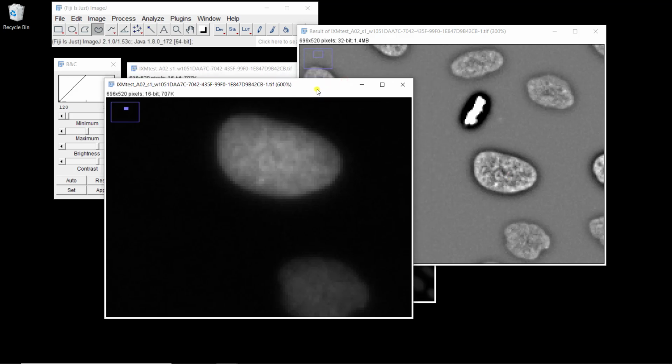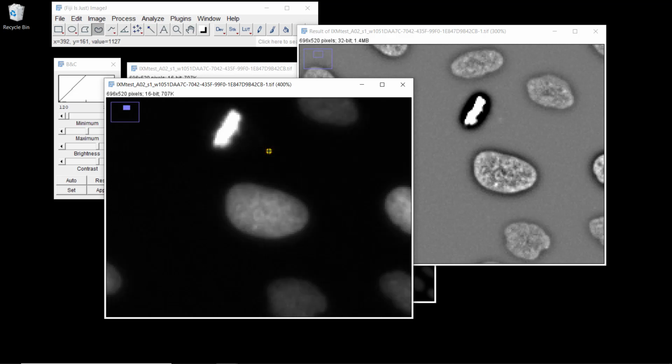And finally, which is probably the most striking, is in the contours, because there you are in a region where you have high intensity on some part, and in the other part it's going to be low intensity. So when you average, it's in between. So when you're on the contour, you're going to have a high difference, and that's why you have negative values just on the contour. Here it's even more striking when you have very huge differences of intensity between the nucleus and the background.